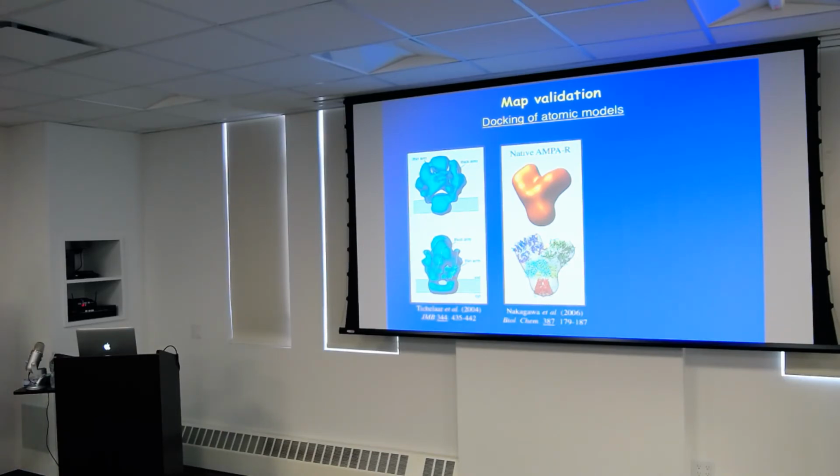Is this how you did it, where you have new validation? Also, it's the same thing, Rosetta, but you iterate against one half map. Yeah.